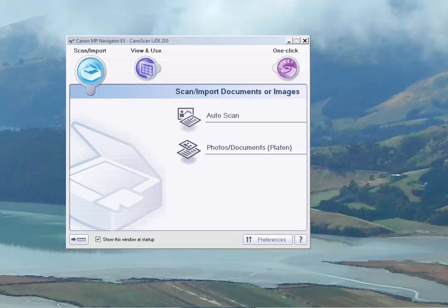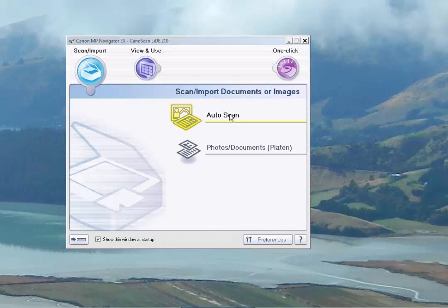Clicking on that, we get the MP Navigator screen that we see right here. It allows us to go the easy way, which we're not going to go, or the advanced way, which we're going to go. So we'll click on that.